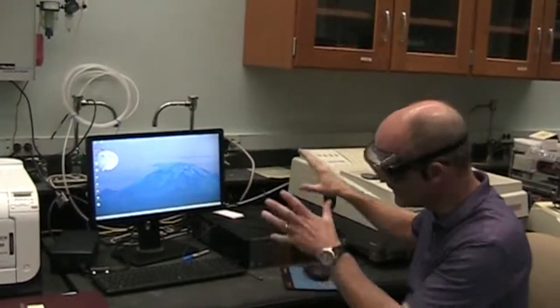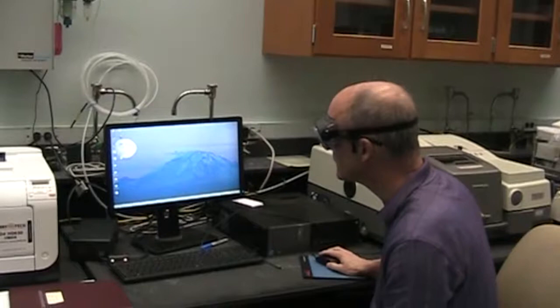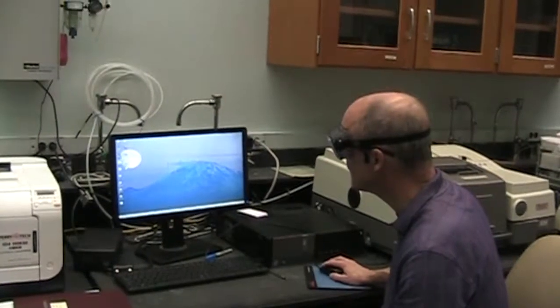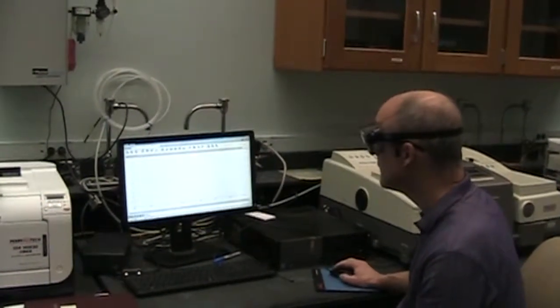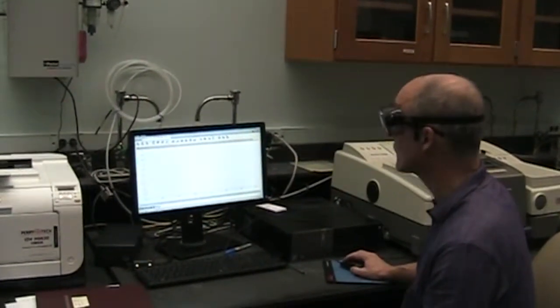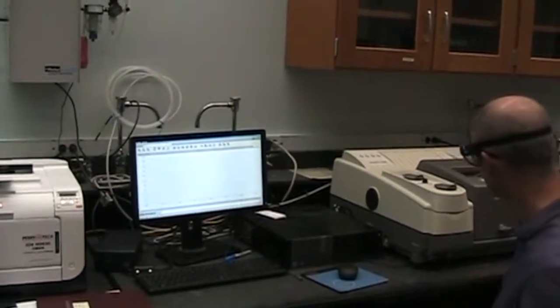Computer's up and running. If it isn't, you can turn it on. Shouldn't be any passwords on this computer. The software we use to run the FTIR is Omnic, O-M-N-I-C. And its icon is there, so I'm just going to double click on that and start it up. And you can see it opens up a screen that has wave numbers at the bottom and then percent transmittance across the top. So we'll come back to the software. We're going to get the instrument ready for the types of samples we're going to be analyzing.